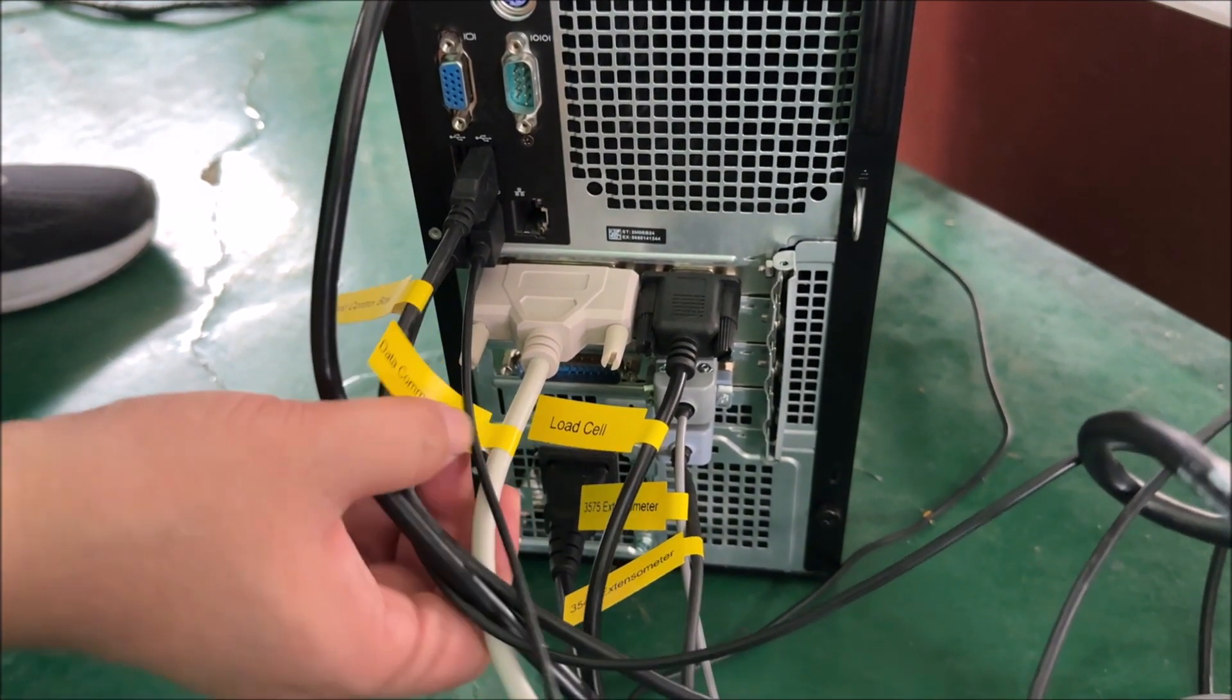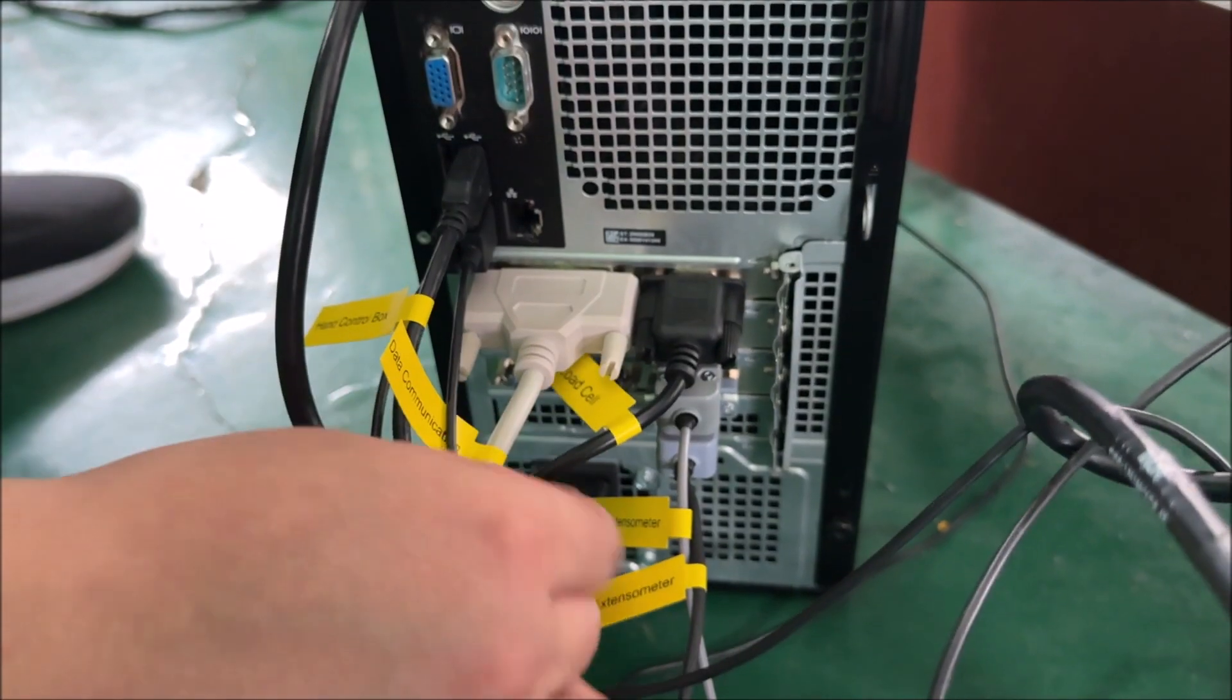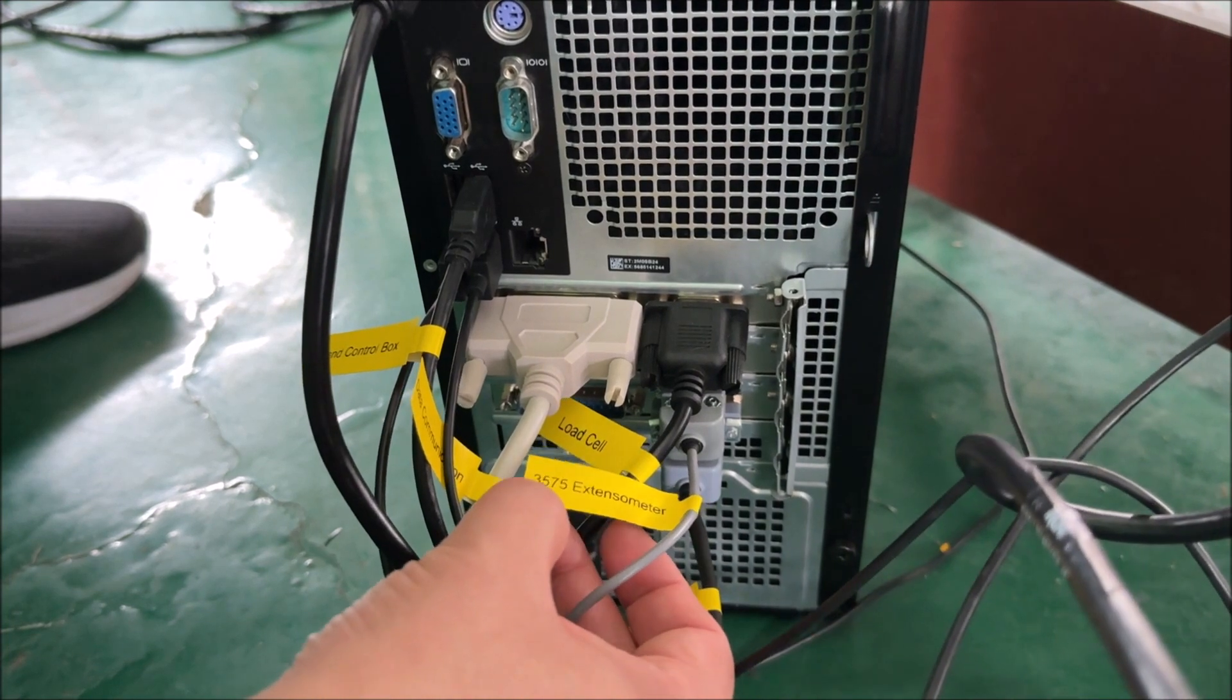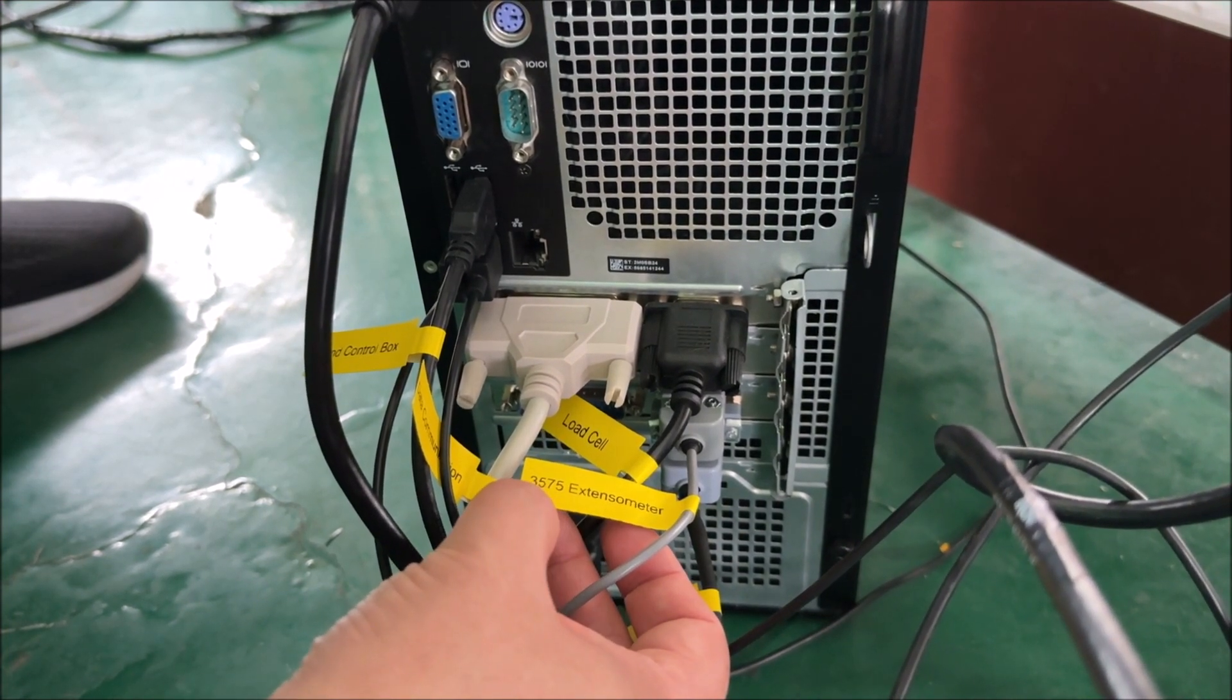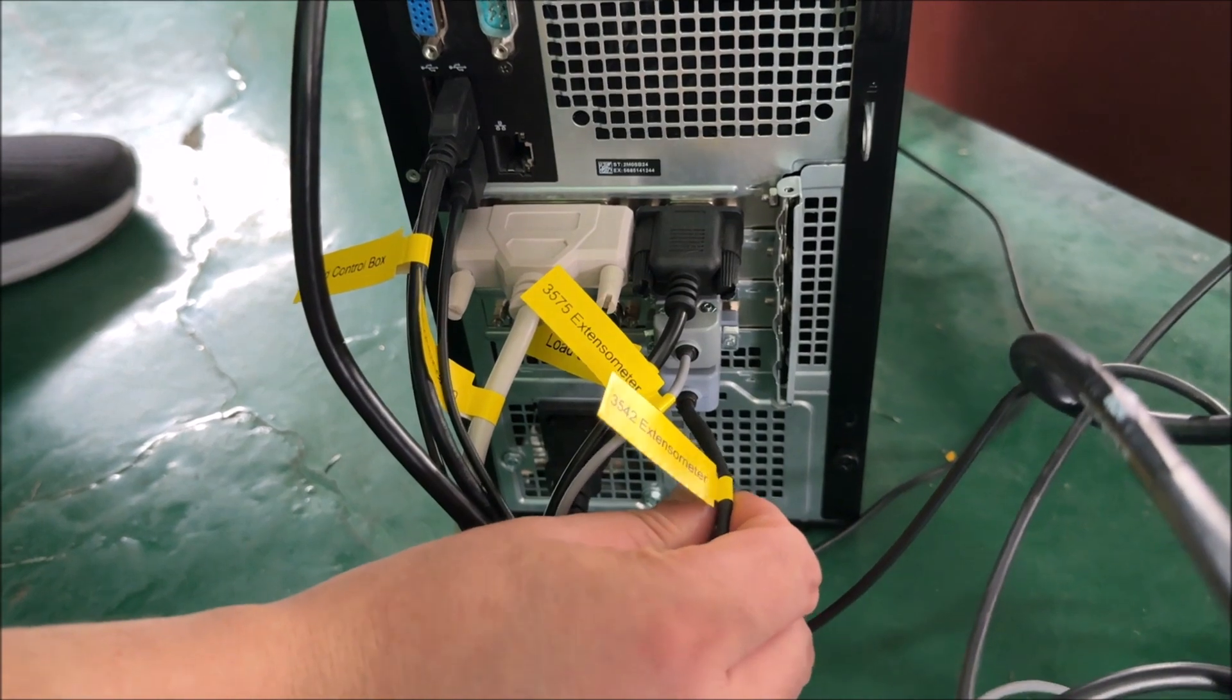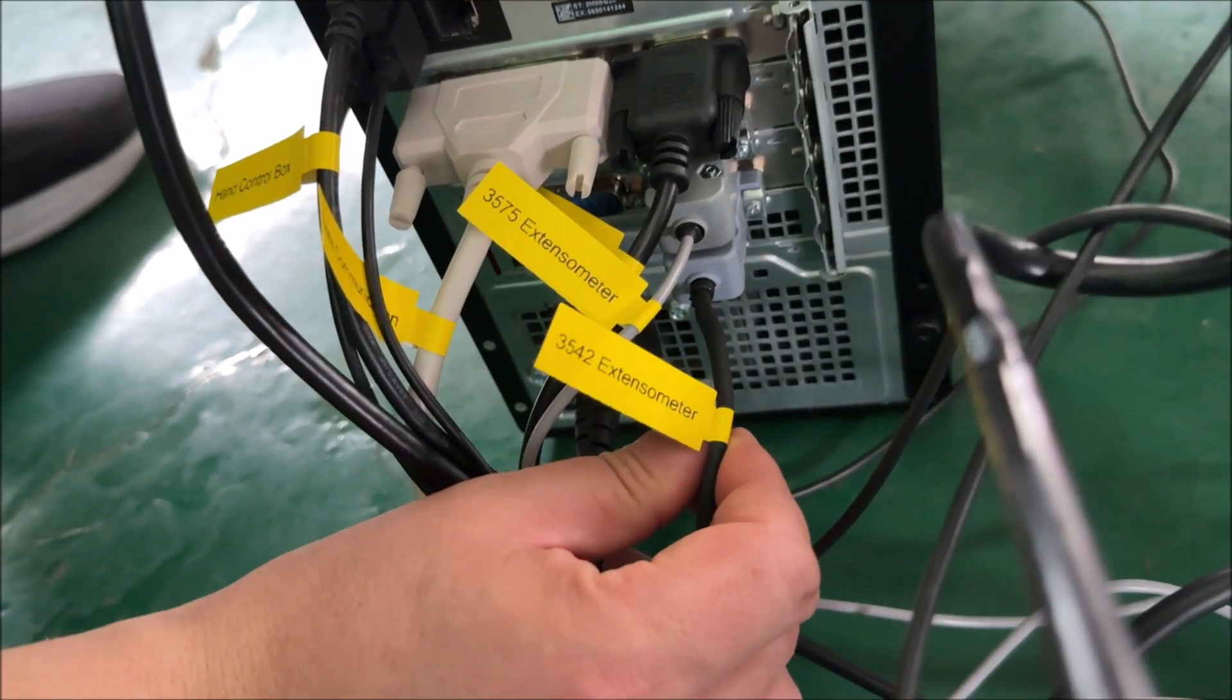Additionally, this is the load cell cable. While this is the extensometer cable, labeled 3575 for one extensometer, and this one is labeled 3542 for the other clip-on extensometer.